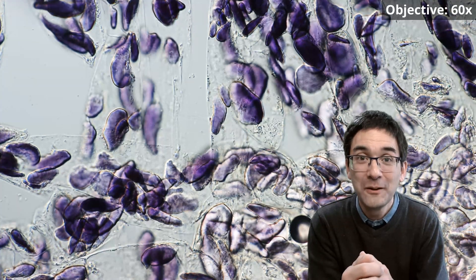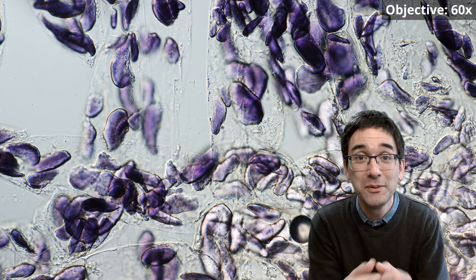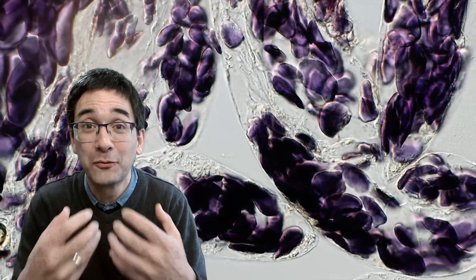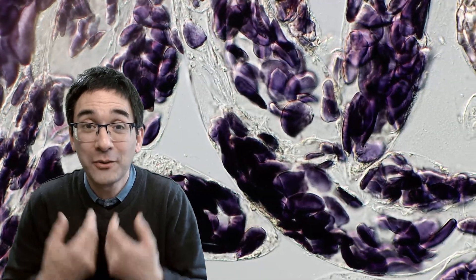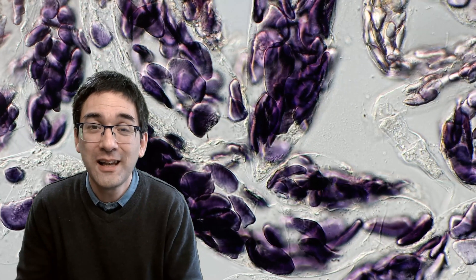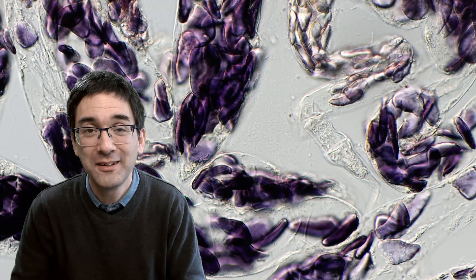And this is also the reason why bananas give us so much energy. When we eat bananas, just like eating potatoes or rice or wheat, we're eating a lot of starch. This is not only an important energy source for the plant but of course also for us, because in our digestive system the starch is broken down again and then the cells can use the glucose for cell respiration and as an energy source.